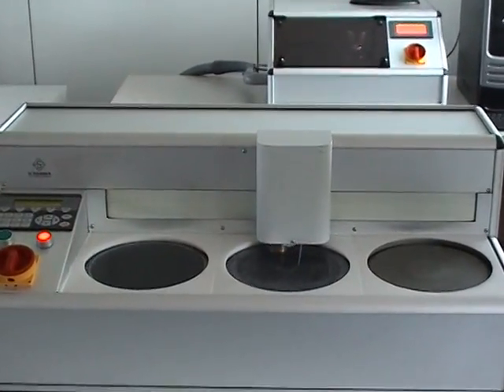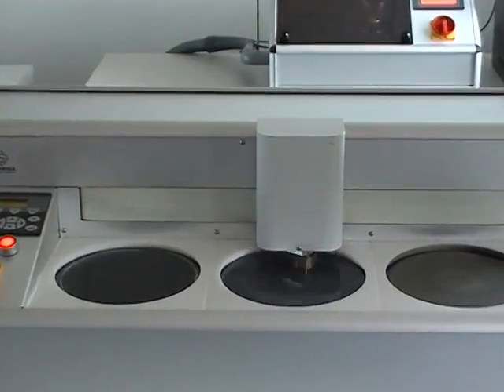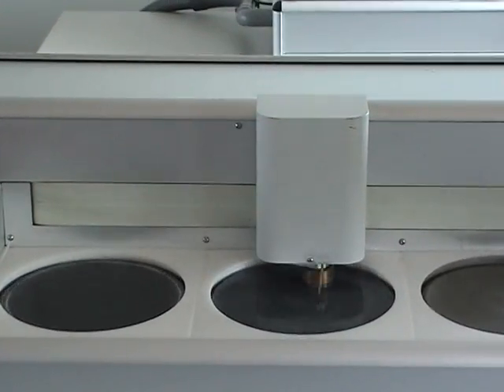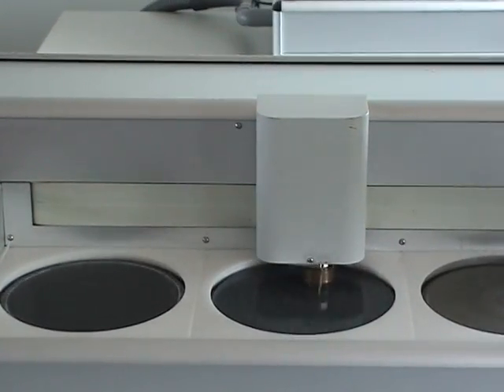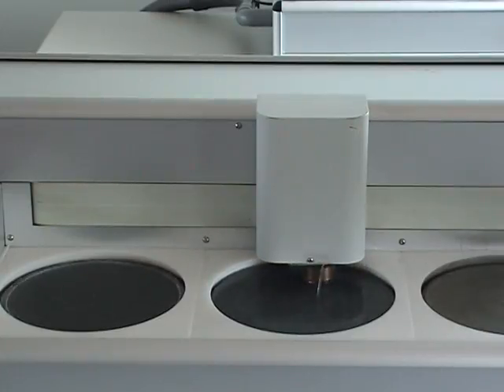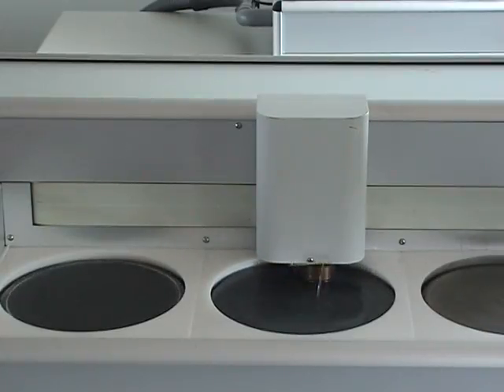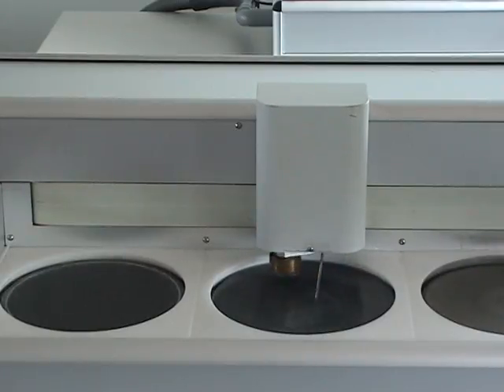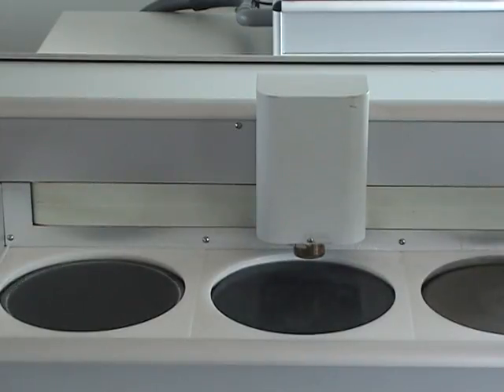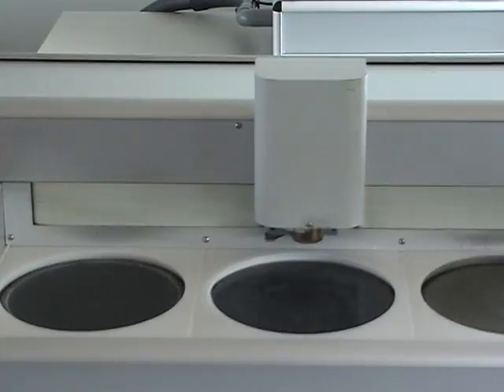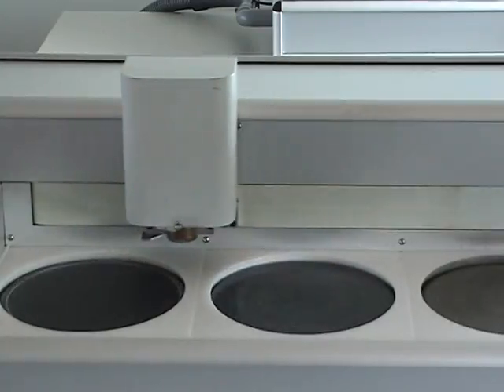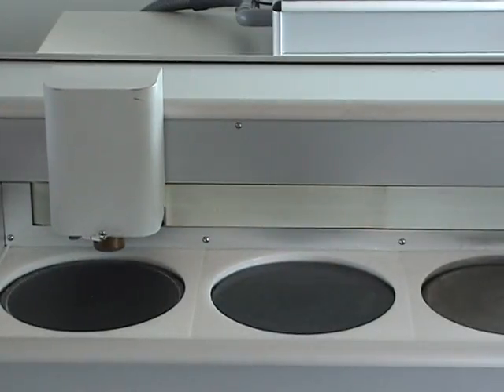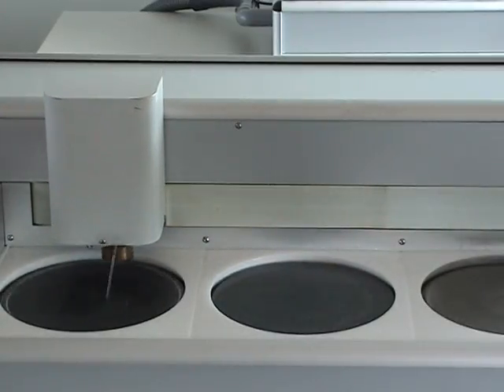At first, a reference measurement is done on the middle grinding station. This station is also used for fine grinding. After the reference measurement, the rough grinding is done on the left station.